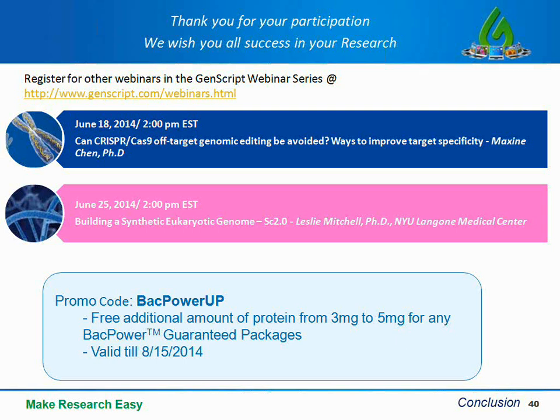I see that questions have been coming in all along. First question, do you use T7 auto-induction? Yes, sometimes we do use T7 auto-induction, but not as often as IPTG induction. Another question, which double tag did you use? When situations need double tag, we commonly use His and FLAG for the double tag.